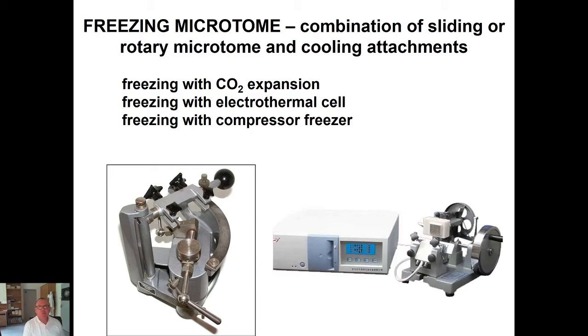If you use fixed tissue which wasn't frozen before sectioning, it was chemically fixed, but now we need to freeze it to make it harder and to allow the formation of sections, of thin slides.